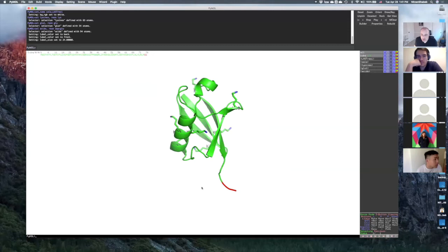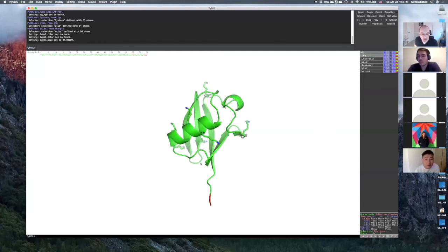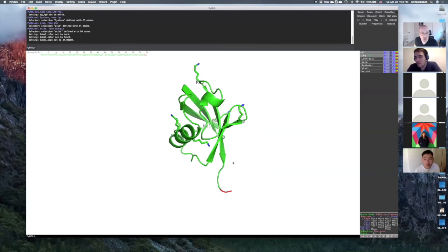So I want to pause now before I move on to the next thing, and just let you know, this is very, very basic, right? There are so many things you can do, but the reason I'm giving you this idea is that it's really up to you how you want to take it. You can do so many things here.